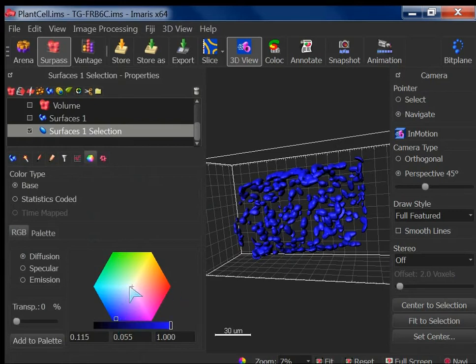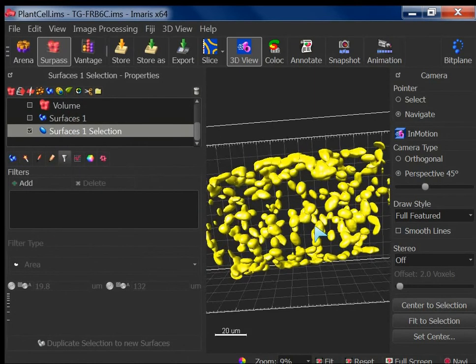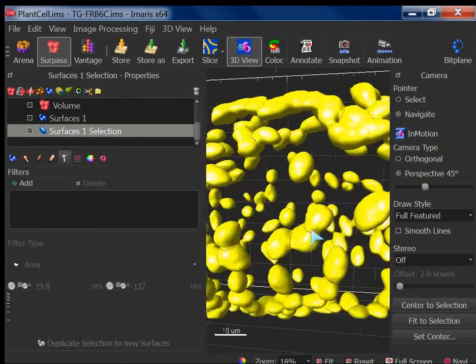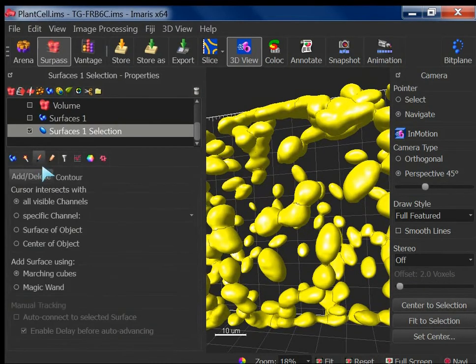Green color. Right. So that's the filtering. That's done. Again, same like spot. I can select or deselect, or I can create the new surface. How do I do that? In draw. Here you can see now the options possible. It's the same option for spot also, which previously you couldn't see because of some problem, right? But now you can see.